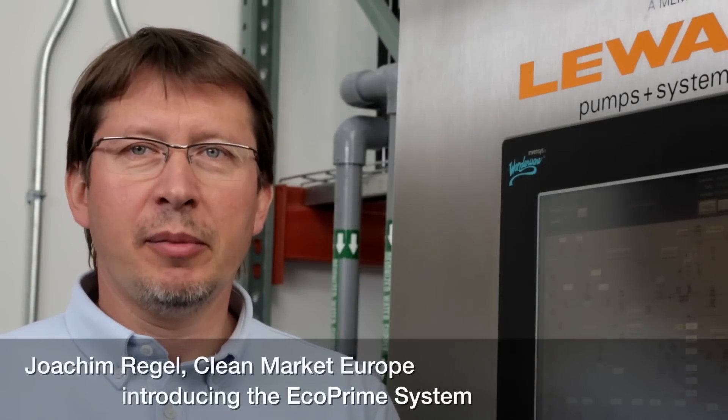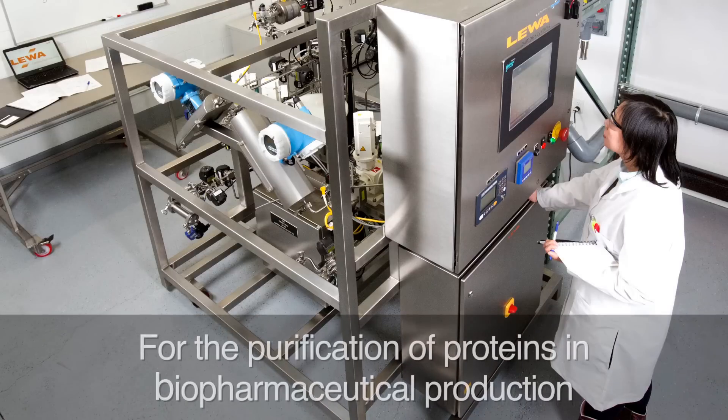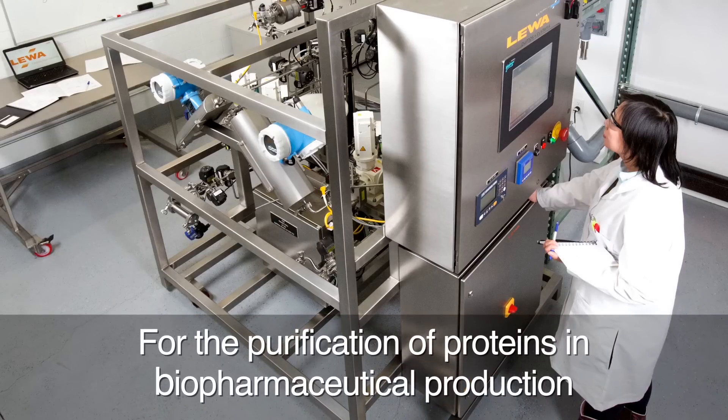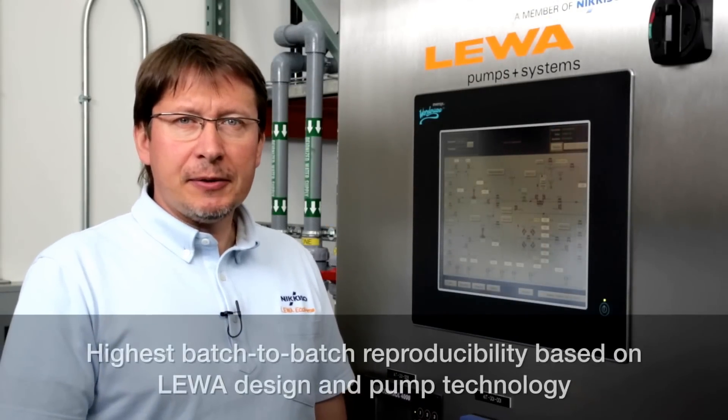Dear colleagues, my name is Joachim Regl. I would like to introduce you to the LEWA EcoPrime Chromatography System. It is a fluid management system that enables the separation of specific proteins from other components in the process of the purification of biopharmaceuticals.